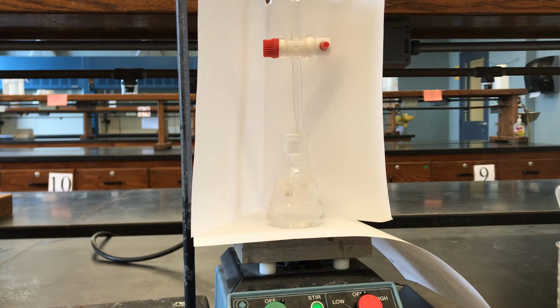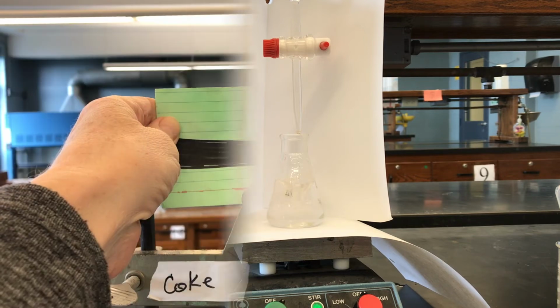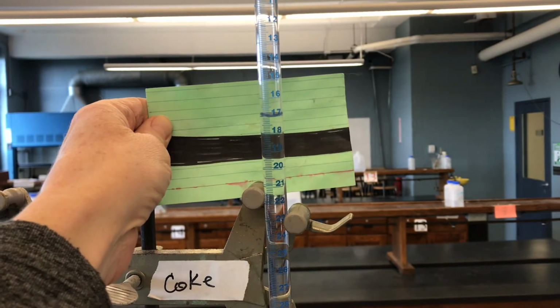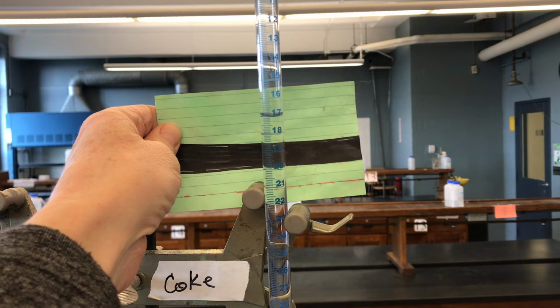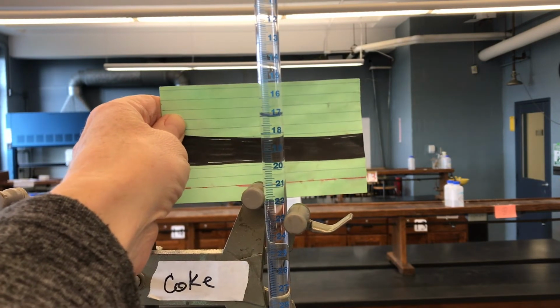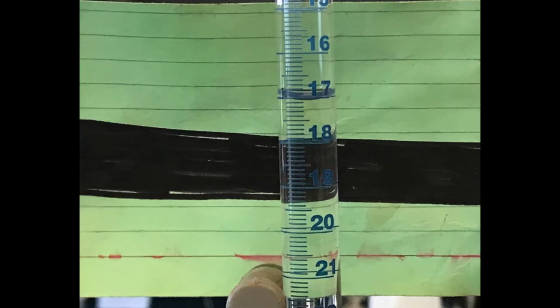So let's go ahead and take our final volume reading. You can see our final volume is somewhere just around 17 mils. Again, I'm going to go ahead and take a picture so we can discuss the exact final volume. The bottom of that meniscus is lying just below that 17 line. It's between the 17.0 and the 17.1 line.